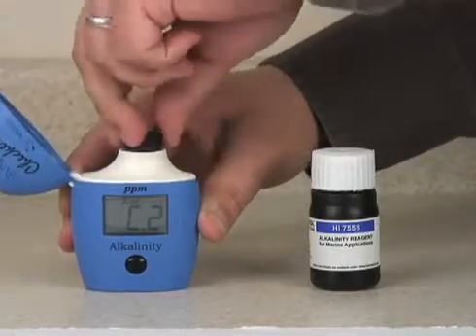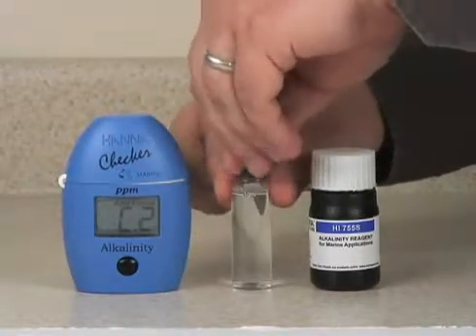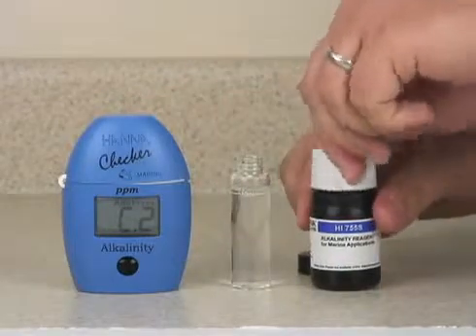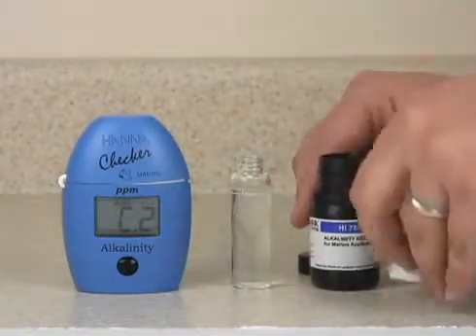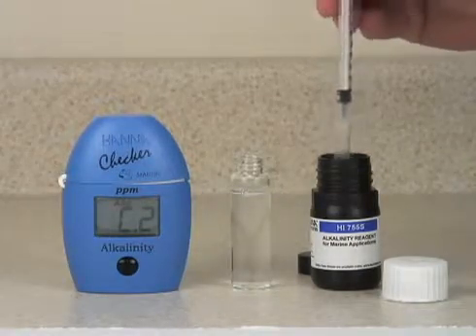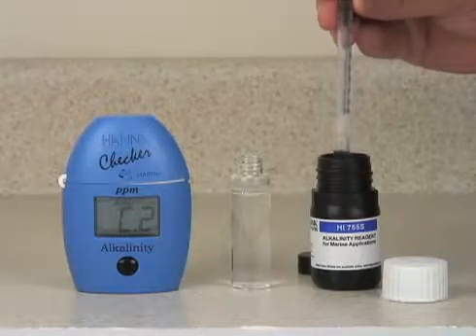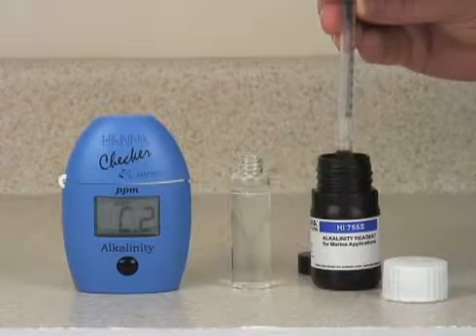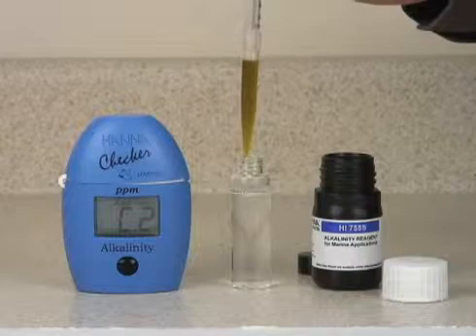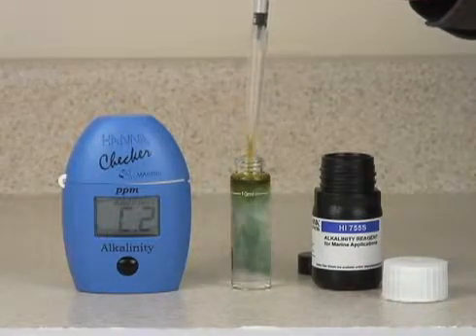Once the C2 message is displayed, you can remove the sample, unscrew the cap, and add the reagent. Use the syringe to measure one milliliter of reagent. You can do this by pulling back the plunger to the zero mark, and then pushing the plunger entirely down to the bottom.